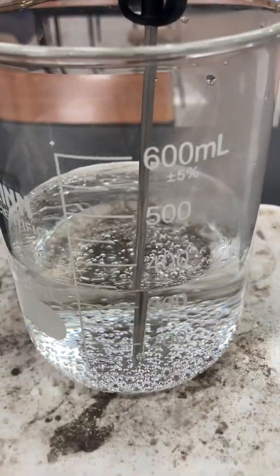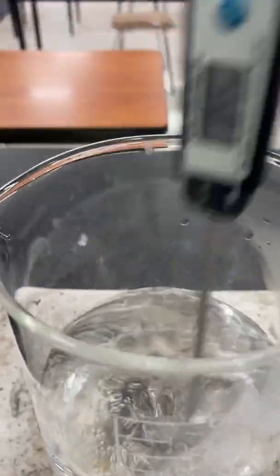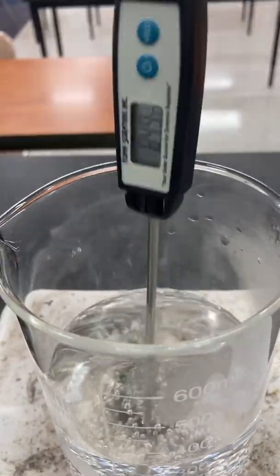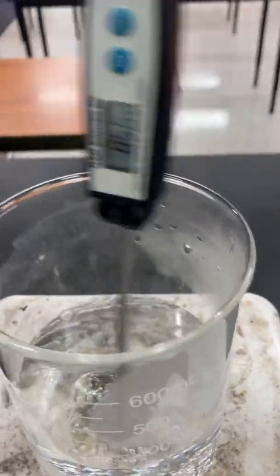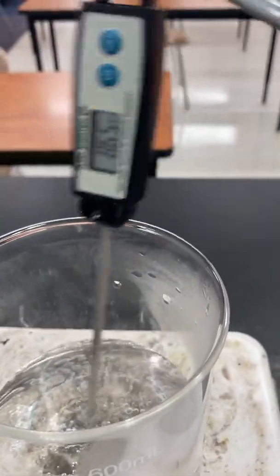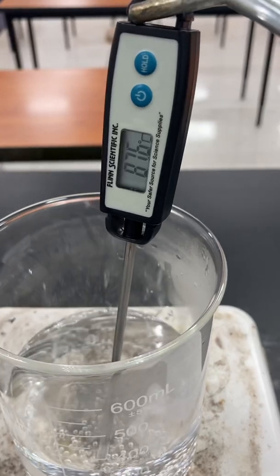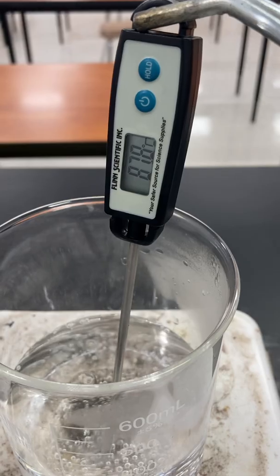I'm now seeing bubbles start to rise in the water. Okay, and at 10 minutes, we're at 84 degrees Celsius. Okay, at 10 minutes and 30 seconds, we are at 87.8 degrees Celsius.